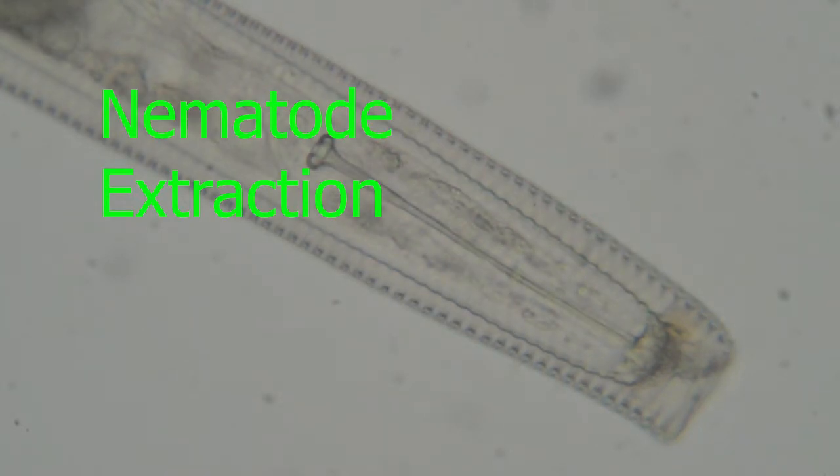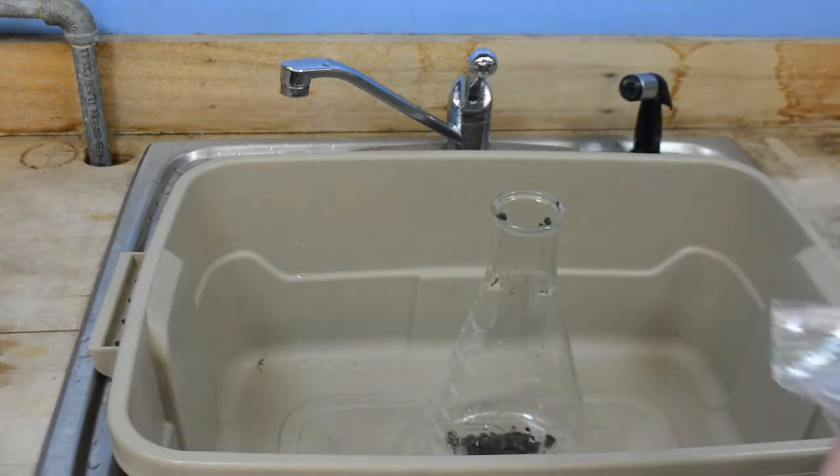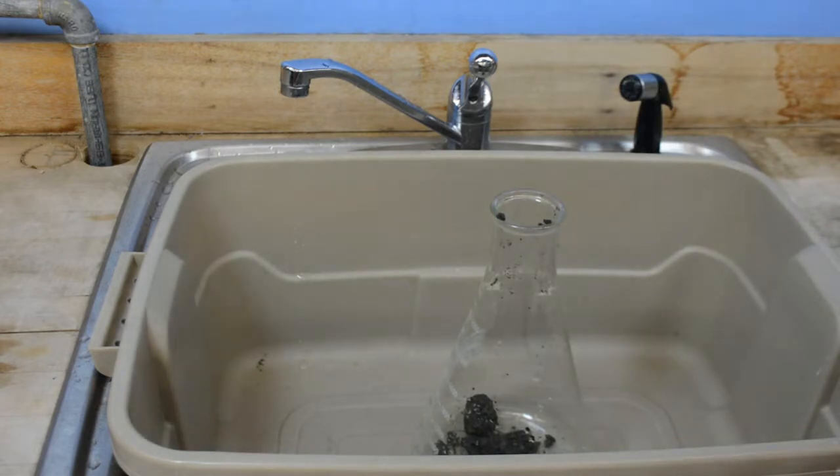This is going to look at the centrifugation flotation method for nematode extraction. We start out with a soil sample, about one cup, and we're going to empty the sample into the bucket.